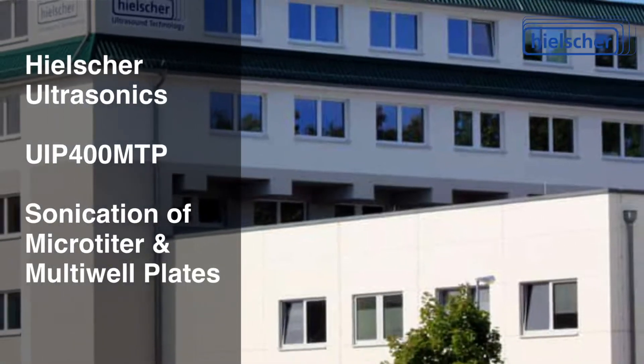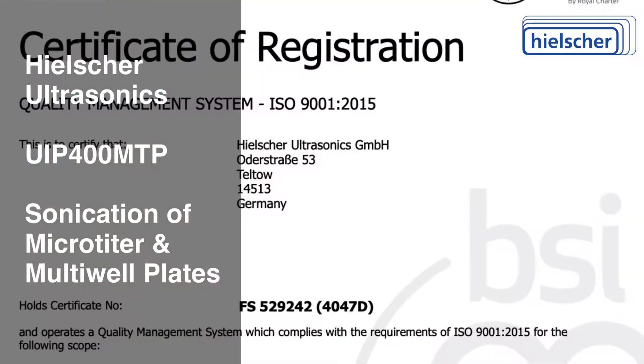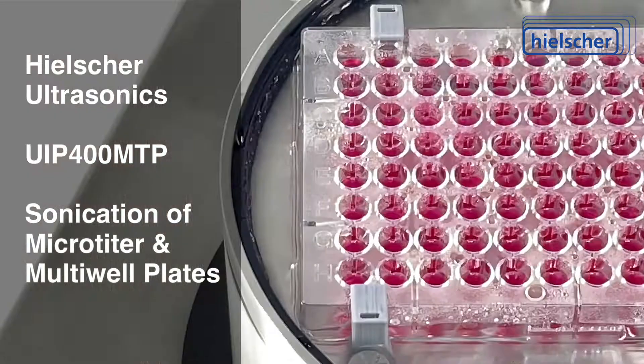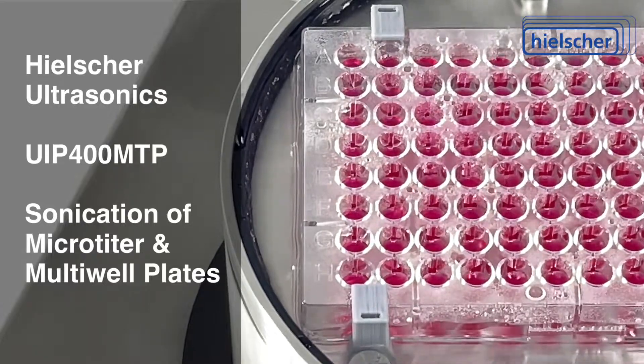Family-owned Hielscher Ultrasonics is the most trusted name in ultrasonics. Hielscher is ISO-certified, and the UIP-400 MTP meets CE standards and is UL, CSA, and RoHS compliant. The UIP-400 MTP can run 24 hours a day for use with auto-samplers.